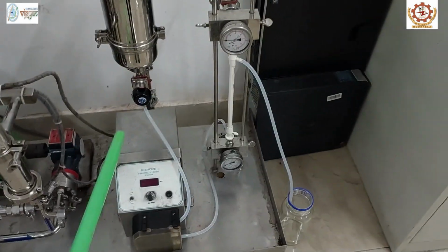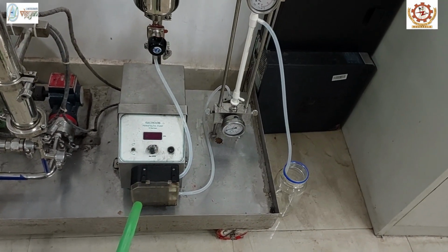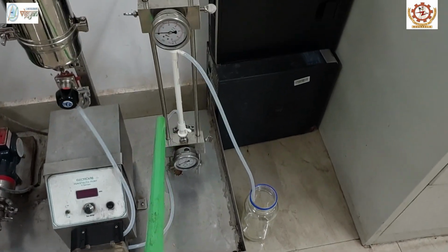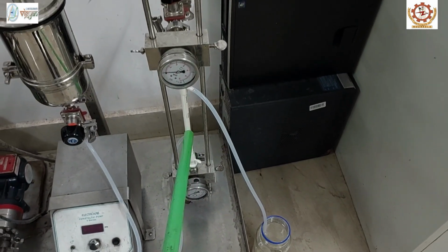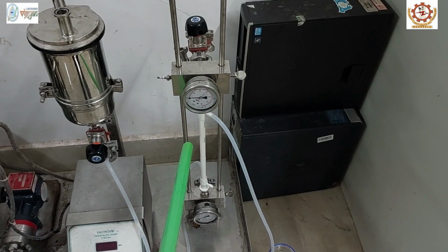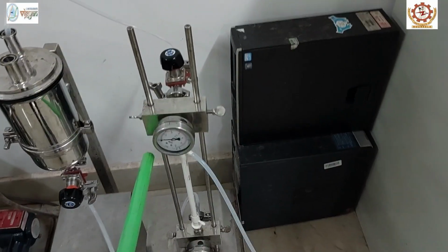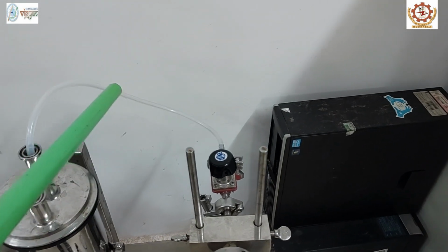This feed will pass through the silicone tube with the help of a peristaltic pump. This peristaltic pump will suck the feed from the feed tank and it will pass through the inlet of the membrane at high pressure. Once it passes through the membrane, the juice particles which have lesser size than the membrane pore size will pass through the membrane and will be collected here as permeate. However, those particles which will not pass through the membrane will be collected through this pipe as retentate.